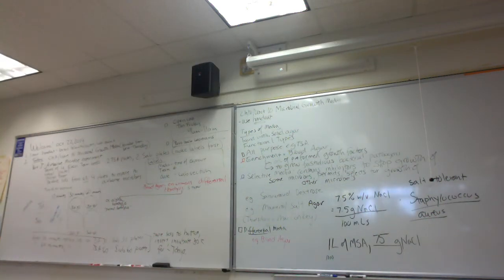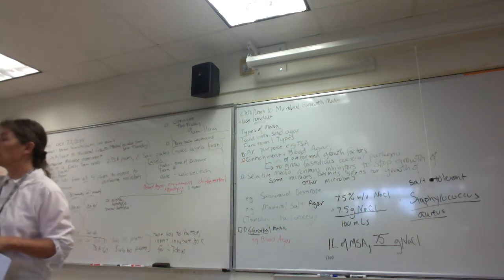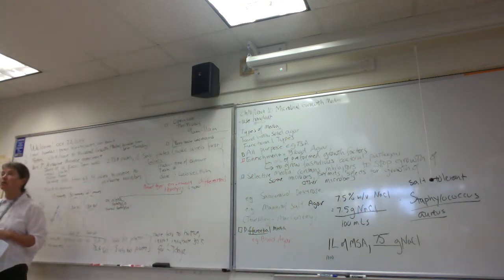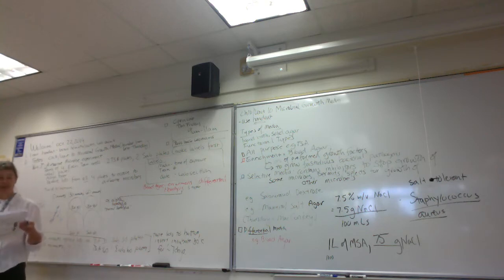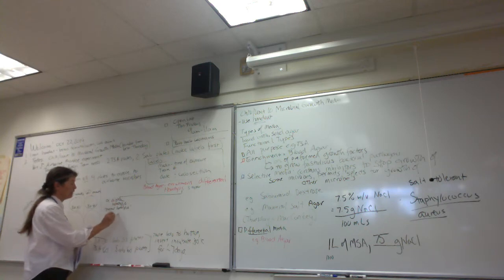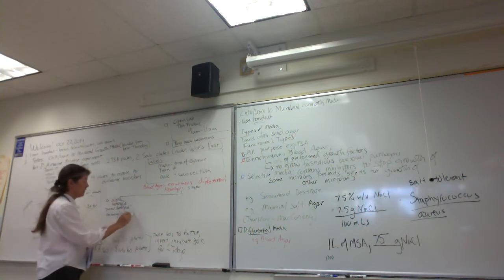So you guys, can you see here how on the throat swabs especially, it looks kind of green? That's alpha hemolysis, right? So we can describe it as a partial hemolysis. The red blood cells are lysed, they're broken open, but the contents aren't destroyed, right? And so Audrey did the research and found out that it's the hemoglobin when it gets oxidized. I'm going to have to check that out. Is it oxygenated versus oxidized? Okay, it's the hemoglobin that's giving that greenish brown color. Okay, so we would describe this as a darkening or greenish discoloration of the agar.